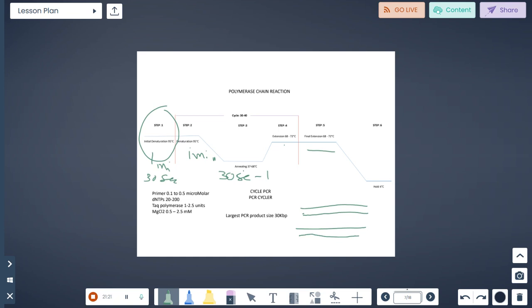So this much portion will be unfinished. This unfinished product can later be polished to its original length by setting up a final extension. Suppose the extension is 1 minute, then the final extension will be around 5 to 10 minutes. So like that you can keep it.